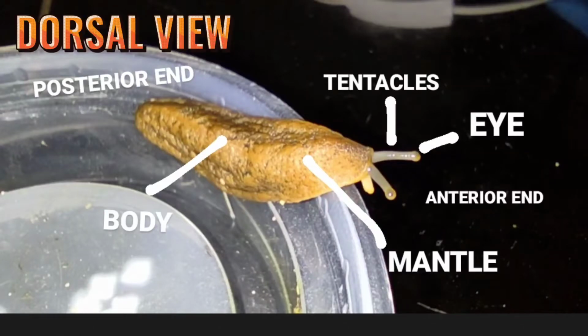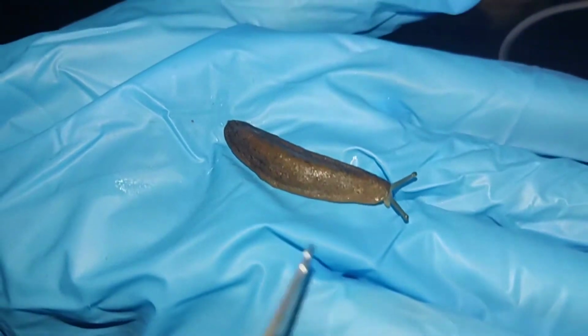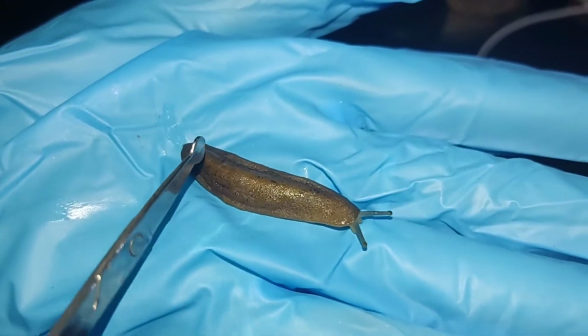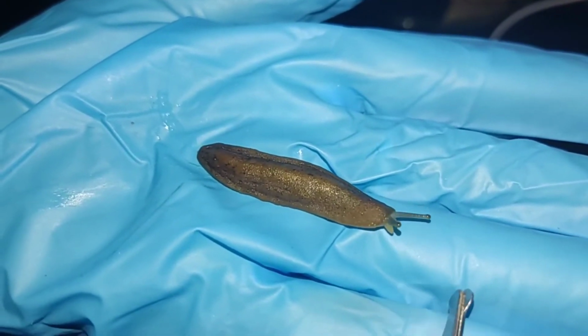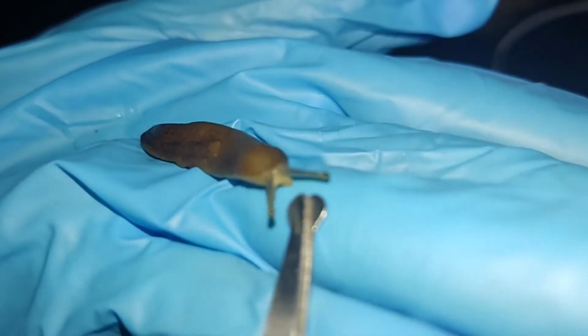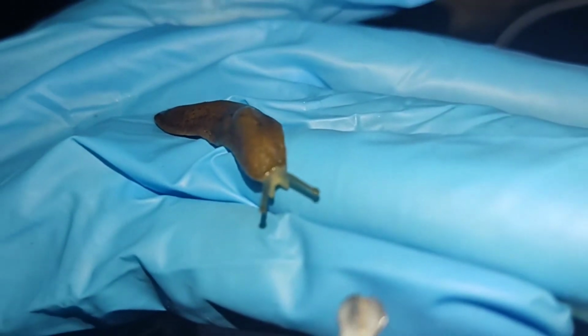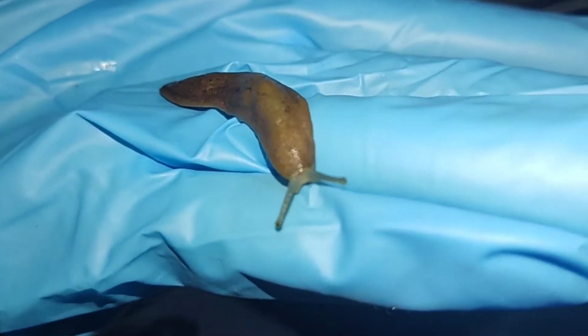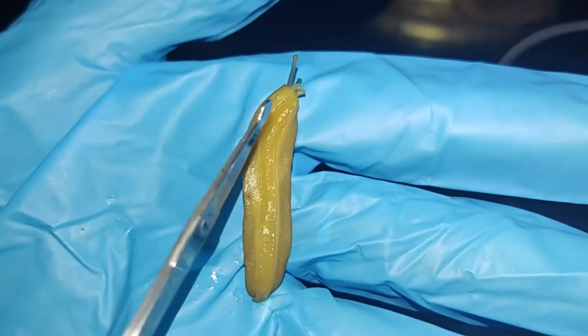Dorsal view. The external anatomy of a slug includes the following. Tentacles: like other pulmonate land gastropods, the majority of land slugs have two pairs of feelers or tentacles on their head. The upper pair is light sensing and has eye spots at the end, while the lower pair provides the sense of smell. Ventral view.